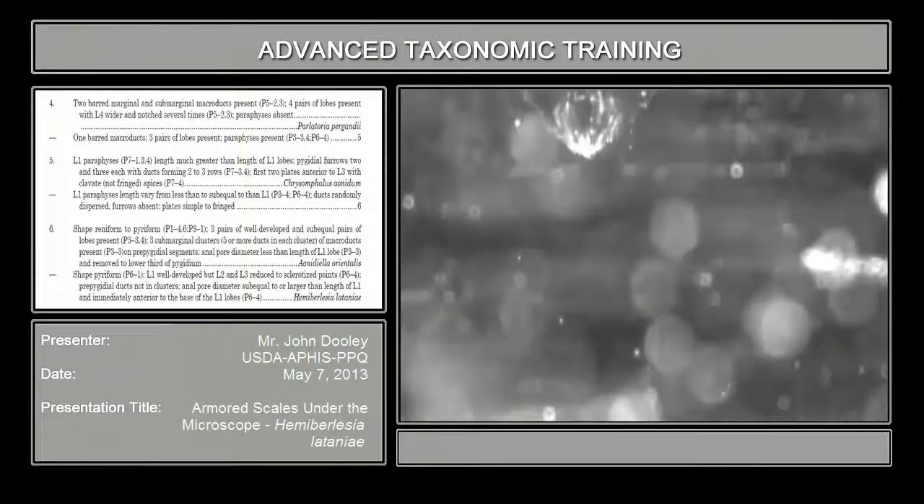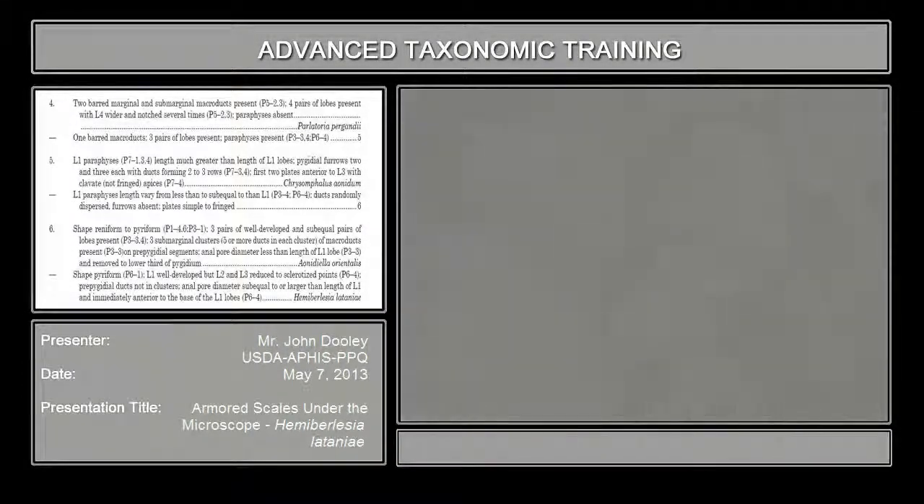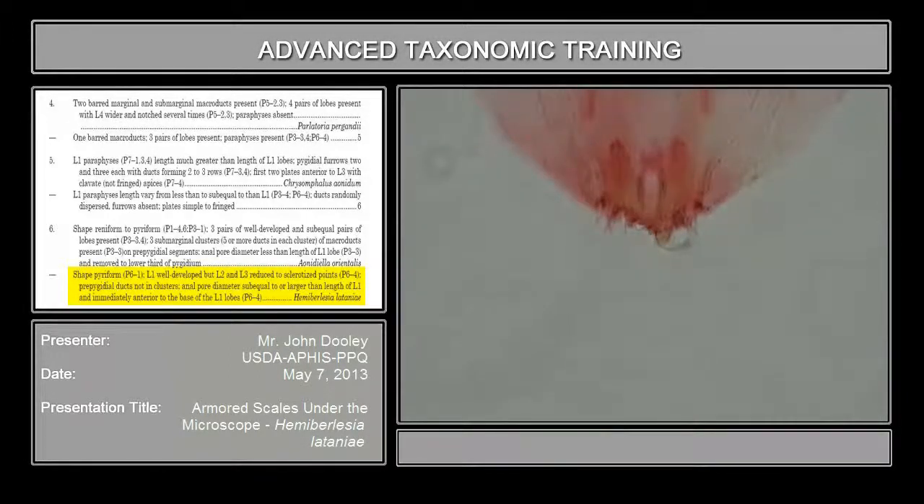The last one is going to be Hemiberlesia latanii. It's almost as wide as it is long. L1 is well developed and L2 and L3 lobes are reduced to sclerotized points. You see one lobe — the other lobe is missing on this one. This is the L1; it's really long. L2 is very, very short, and L3 is somewhere hidden around these plates over here.